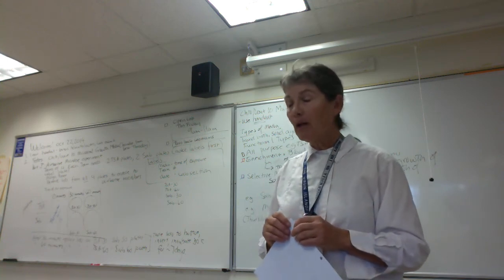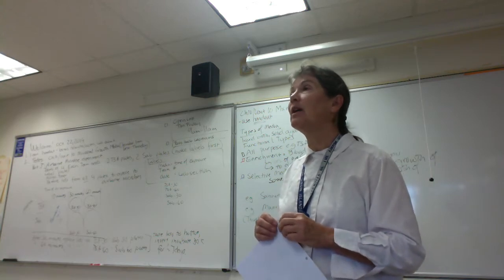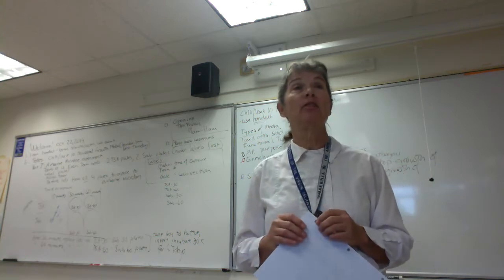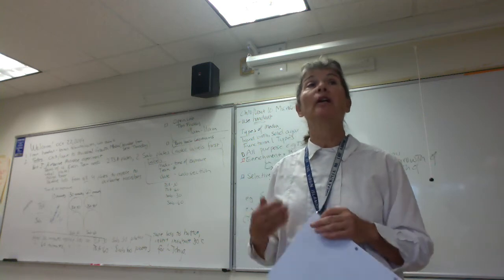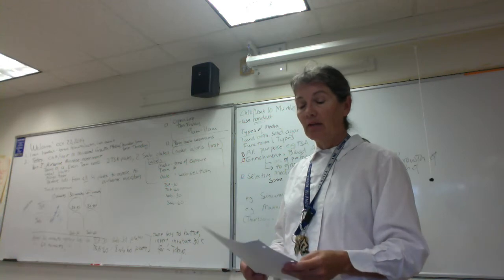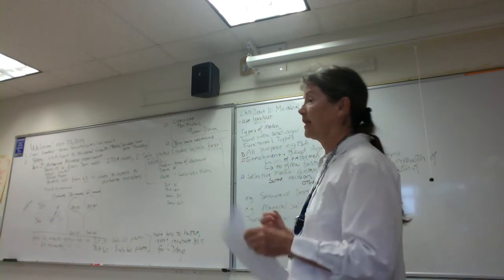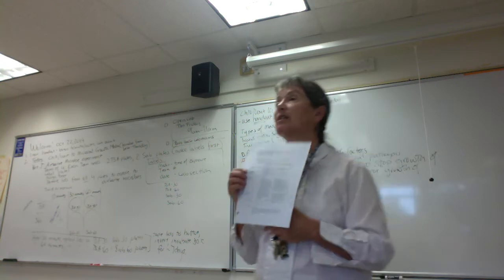Right? We need to grow our microbes to do metabolic tests. We need to grow our microbes to do antibiotic sensitivity testing. These are just a few examples of why we want to grow our microbes, feed them, have them replicate. Okay, so if we're going to talk about, folks, different types of media, you can see there's different ways to classify media.